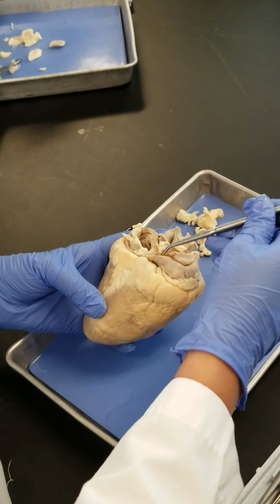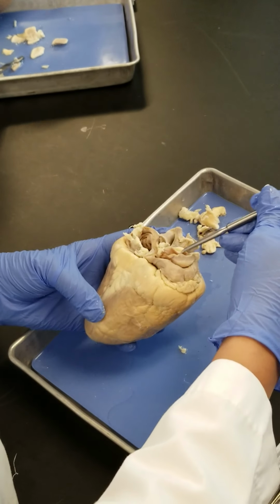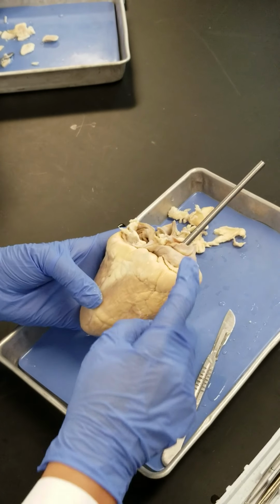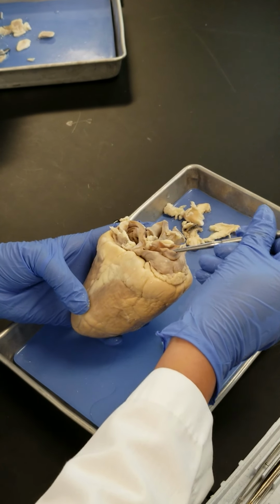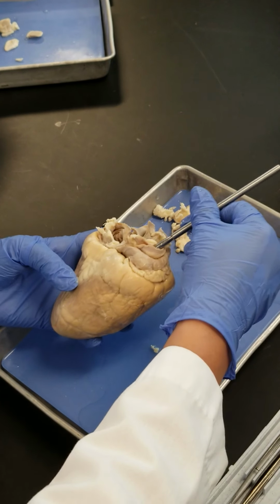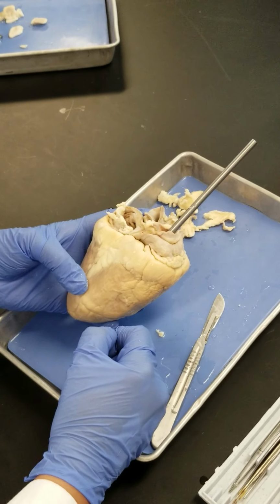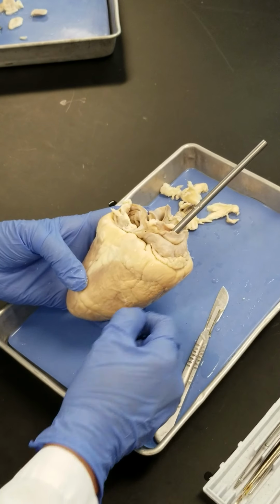They bring the blood from the whole system of the body, right? So this is the direction that the superior vena cava gets into the right atrium from here, right? So this is the opening of the superior vena cava. The rest of it has been cut here, but this is the opening of the superior vena cava. Okay, now search and see if you can find the inferior vena cava. You can use your fingers. This is the superior one.